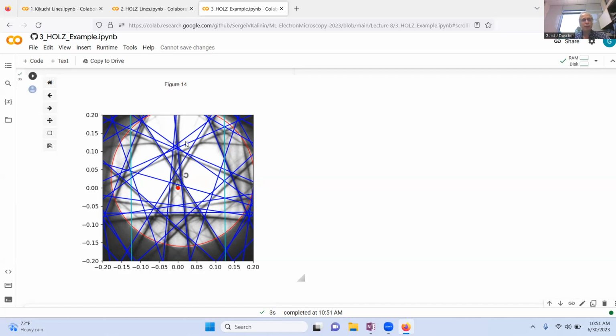And finding this kind of patterns and the right experimental conditions and so on can, of course, be done quickly with machine learning algorithms and doesn't have to go through just a simple grid search. So there's lots of opportunity here.